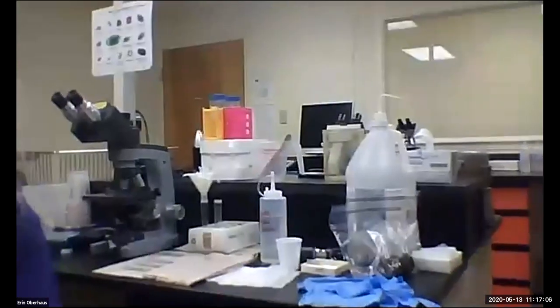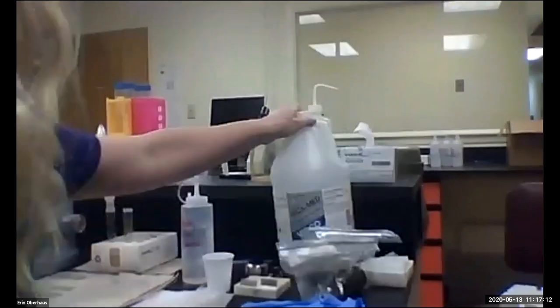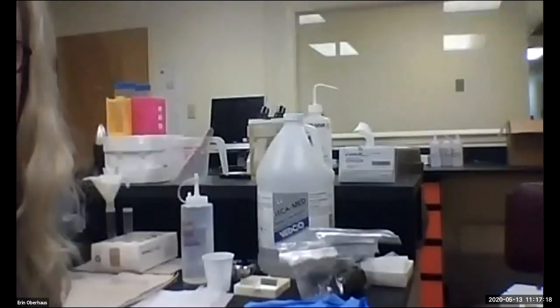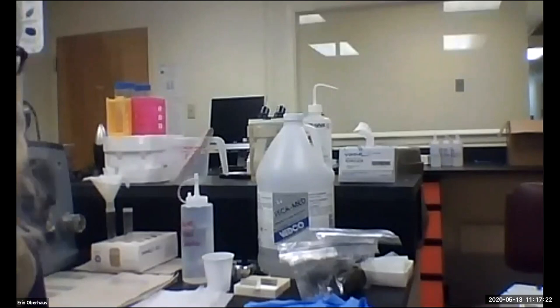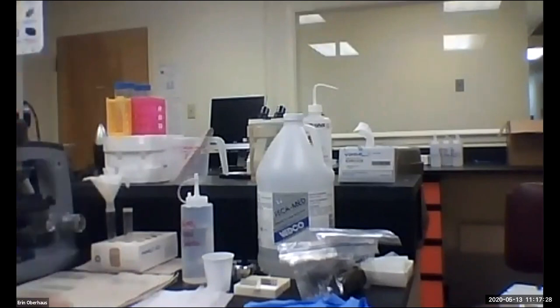What you'll need, I don't know if I can kind of zoom you in here. You will need some sort of fecal solution. The goal of a fecal solution is basically to create a solution that is more dense than the parasite egg. So you need a specific gravity that is greater than the parasite egg so that they rise to the top and can stick to a cover slip and be visualized under a microscope.